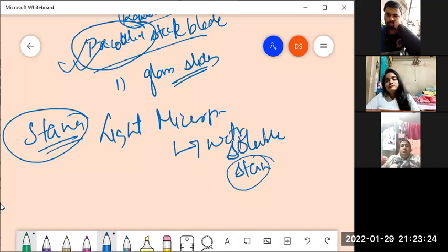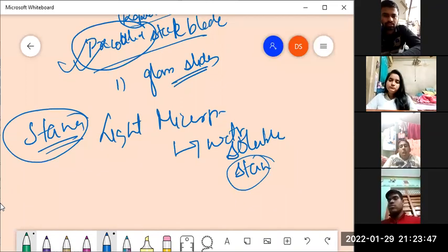Water is a relatively more common resource in the laboratory. You do not need to buy water in huge amounts. When you are spending on a stain, consider purchasing only the raw part of the stain. You can prepare your stain by dissolving the raw stain in water, because for light microscopy, we use the water-soluble stains. Right.